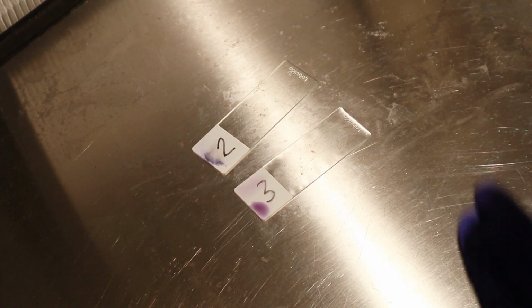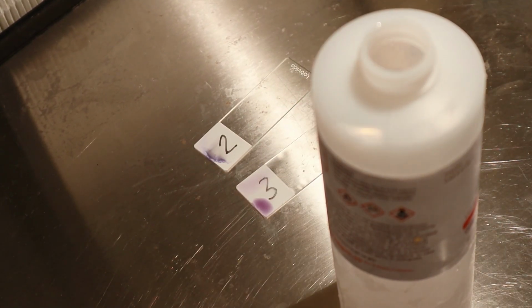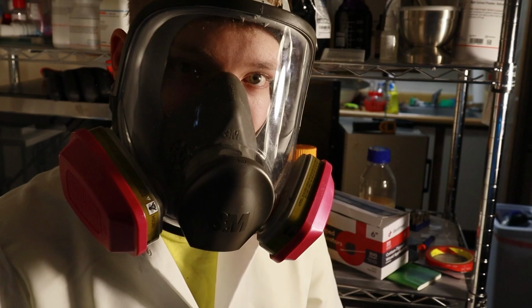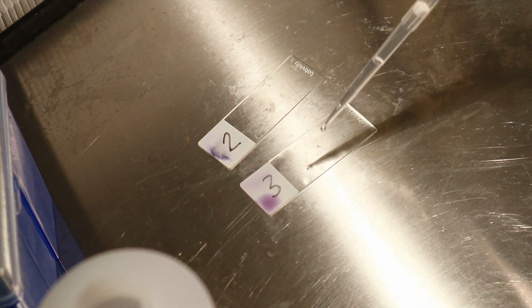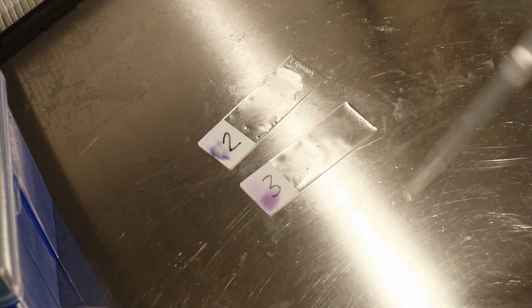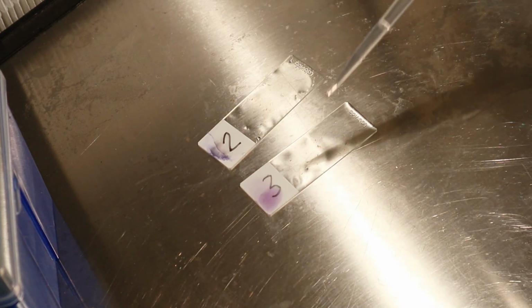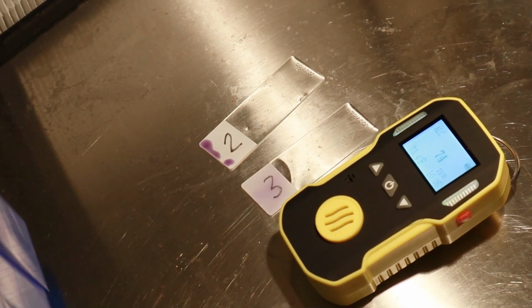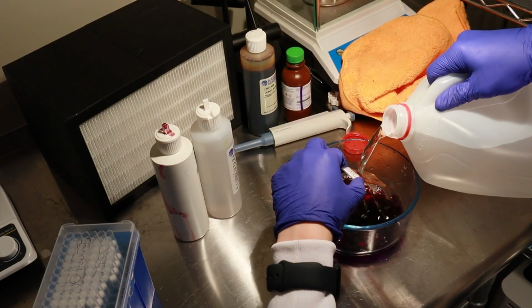After leaving the methanol in my freezer overnight, I then prepared another bacterial smear on a fresh plate and slide with my inoculation loop, and while wearing a full-face respirator with 3M cartridges that protect against methanol fumes, I opened the methanol and pipetted out 1 milliliter of methanol, pipetting it onto the slide. And I kept pipetting on more until I believed it could last 15 minutes without evaporating. I then waited 15 minutes and let the slide air dry, then proceeded to do another gram stain.